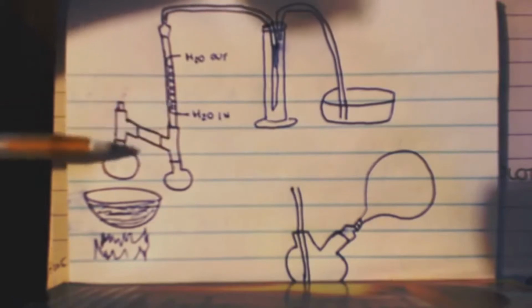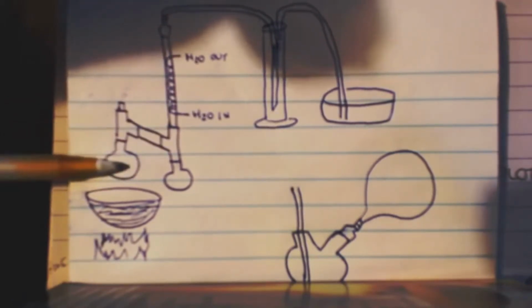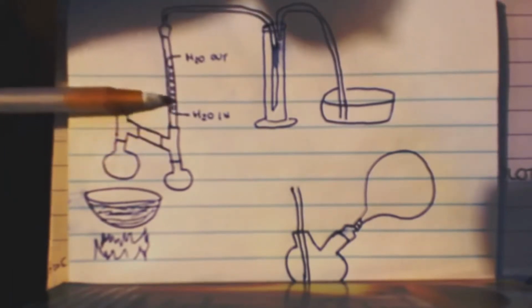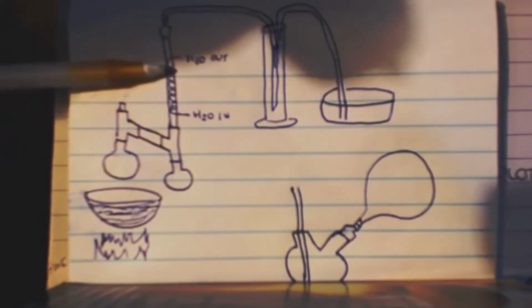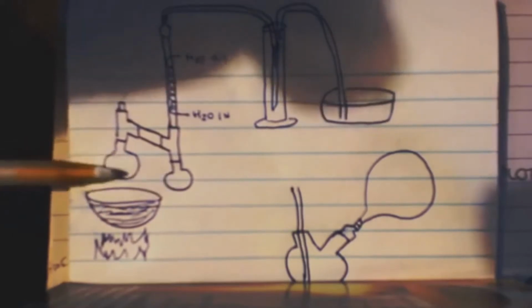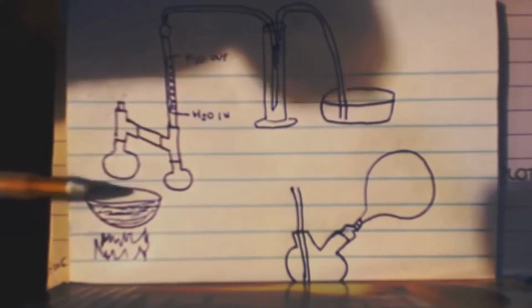And it'll come up here just like a Dean Stark apparatus, right? It's going to distill off the water, come up here, and now this is your water-cooled condenser. The water vapor comes up, it gets condensed back into water, and it goes into this pot instead of going back into the same pot, right? So this will stay dry the whole time.